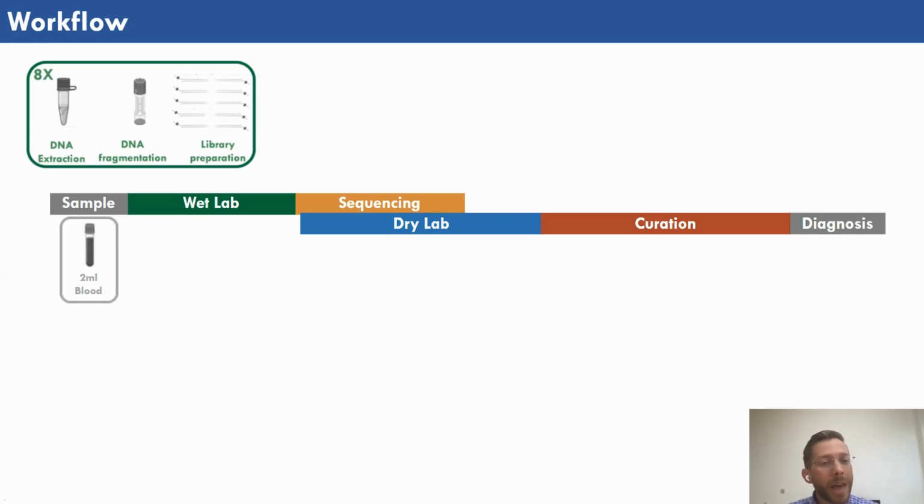So remember, initially, this study was targeting young patients, and you can only extract a certain amount of volume of blood from these patients because they're so small. So we targeted 2 mils of blood, and we wanted to see how much DNA we could get out of a small sample of blood. From there, we optimized and scaled the library preparation in order to get this DNA prepared to be sequenced.